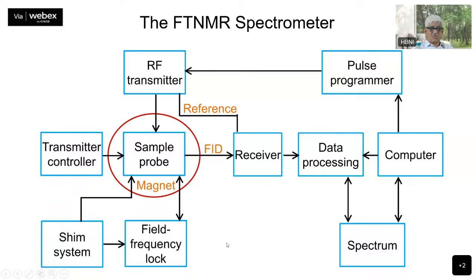Okay. So typically one uses for this the dispersive signal. You remember you have signals of absorptive type and dispersive type. Dispersive type is like this. Okay, this is the center, and as you go along here, this is your frequency coordinate. So at the resonance condition, this has a zero value. A small change in the field will cause a shift in this frequency. Therefore, you will start generating a signal. Either you get it here or here, you will get a signal.